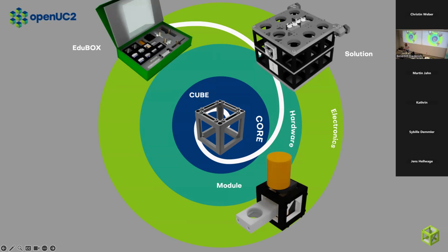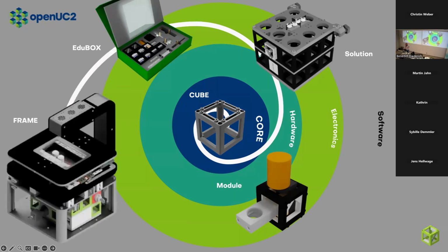And then once you have understood how this whole thing works, because you can actually start in elementary school and then go all the way to the research institute or industry, you can apply your knowledge to this thing. And it's always the same footprint. So what you will see later here, you can basically move out this whole mechanism, and it's still filled with cubes. I will show you that in a second.